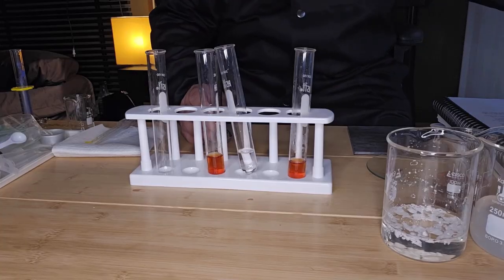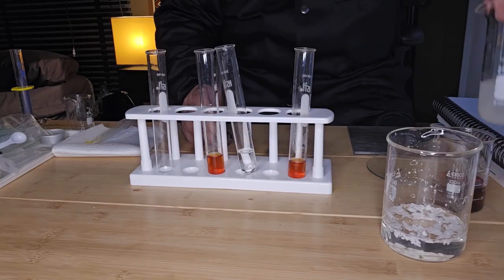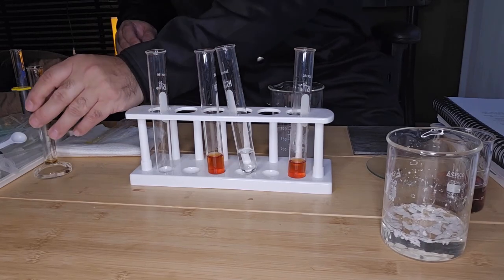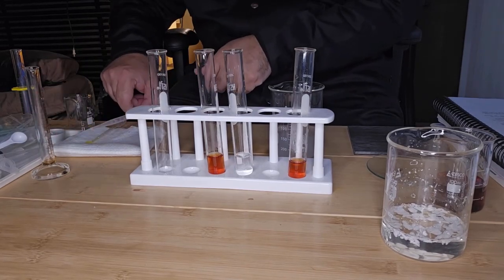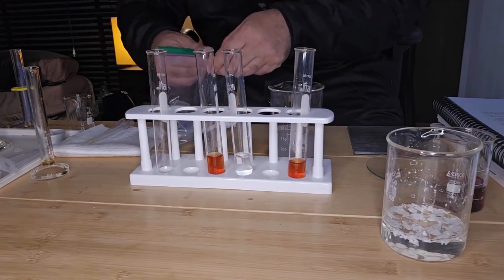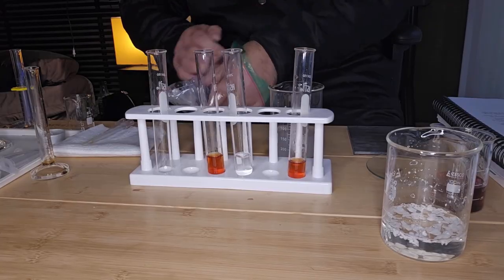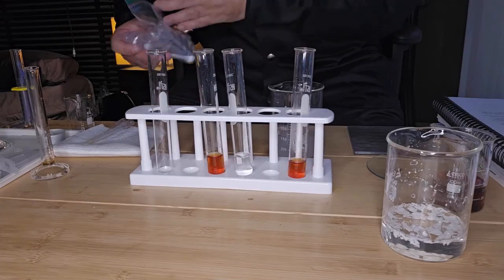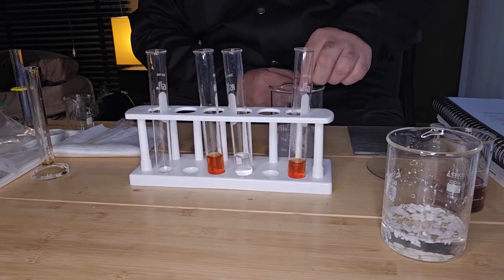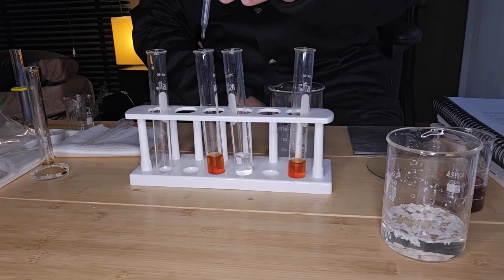And what I'm going to do is I'm going to add 5 drops of aluminum sulfate. Okay, 5 drops. Let me get my dropper out. And I'm going to add 5 drops. And we'll see what happens. Okay. And I'm going to add it to each one.